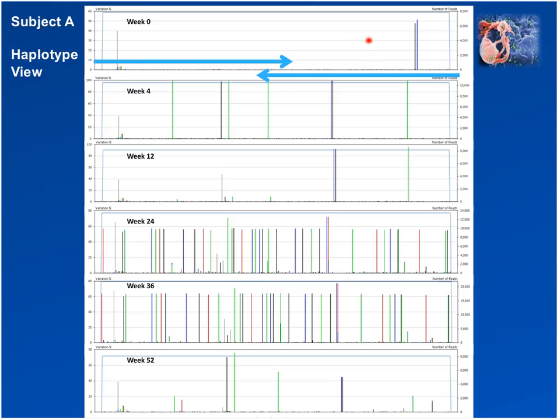What I mean is that underneath each of these panels, there are 8 to 10,000 sequences represented in this case. And any time that there is a difference in the sequences in this alignment with the reference sequence, a colored bar appears.